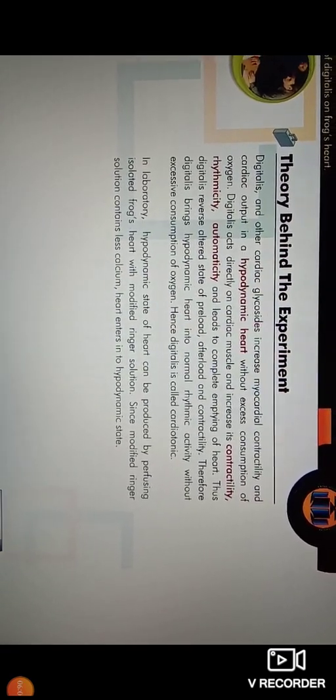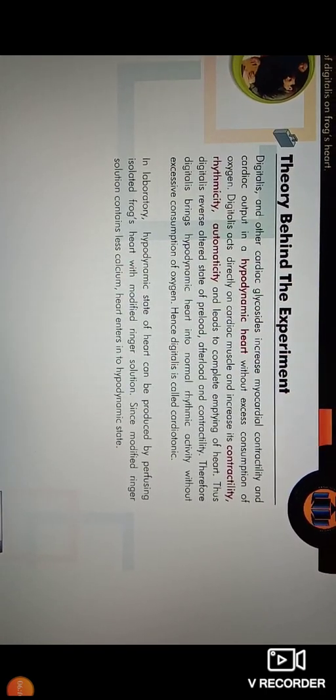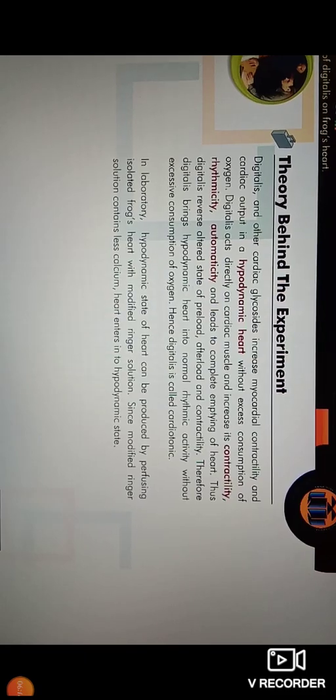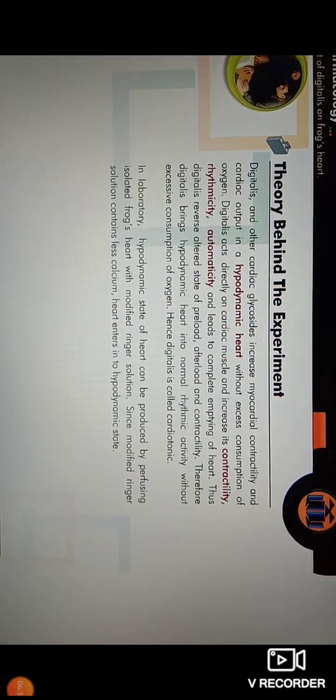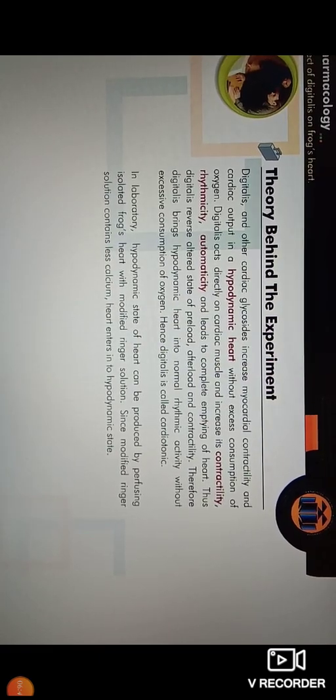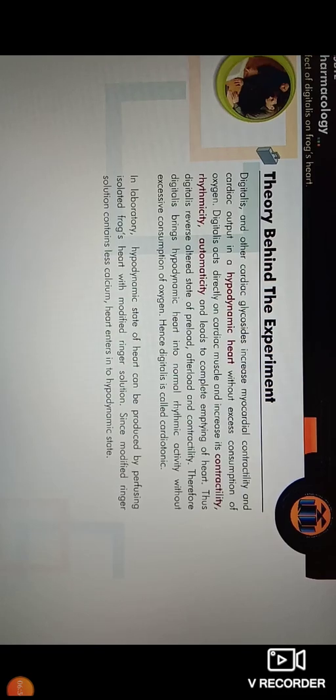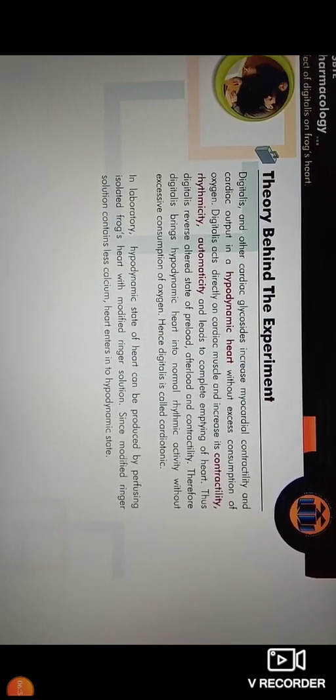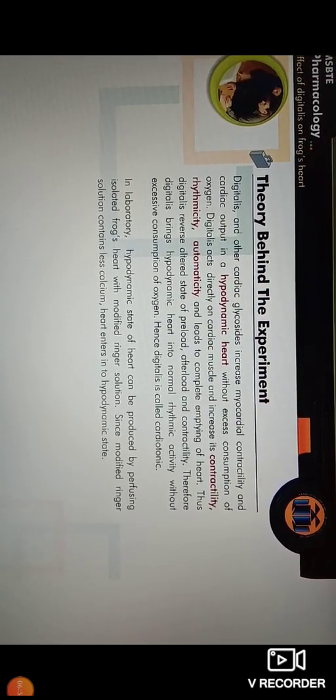In this experiment, we will see the effect of digitalis on the frog heart. Digitalis and other cardiac glycosides increase the myocardial contractility and cardiac output in the case of a hypodynamic heart, without excessive consumption of oxygen. Digitalis acts directly on the cardiac muscle and thereby increases the myocardial contractility and cardiac output. It also increases contractility, rhythmicity, and automaticity of the heart, leading to complete emination of the heart. Digitalis shows a direct effect on the heart muscles.